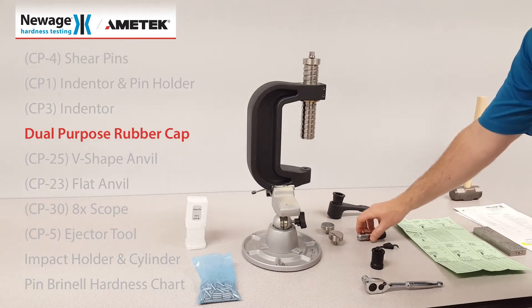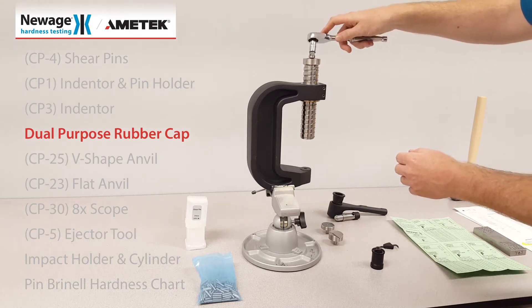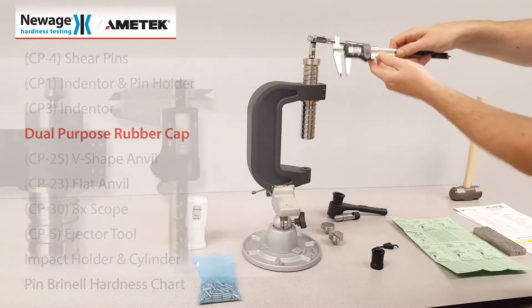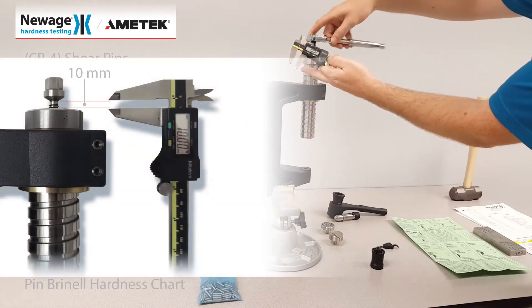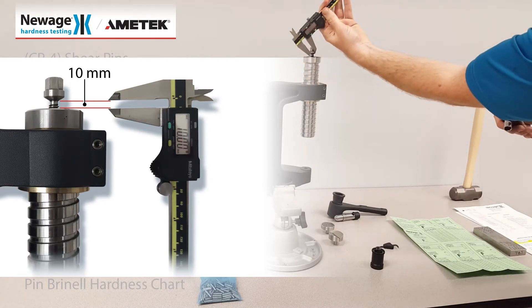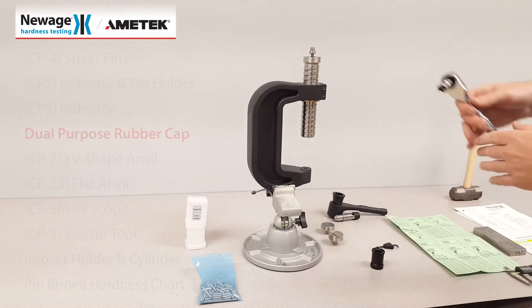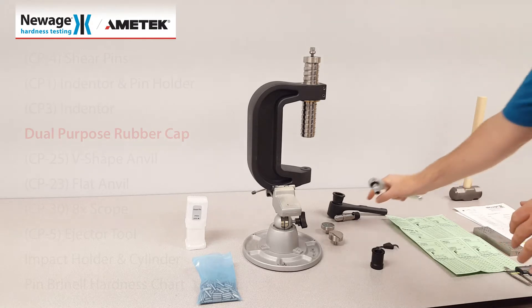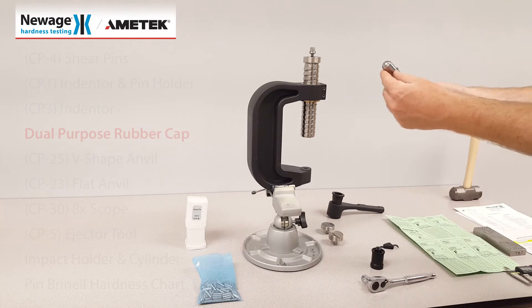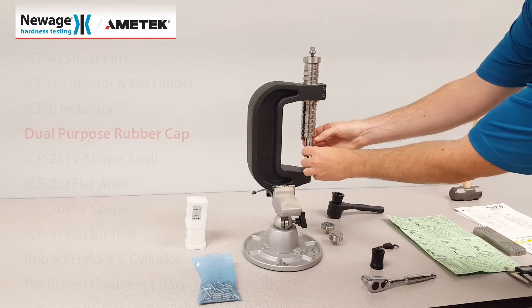Before you perform the test, back off the drive screw approximately one centimeter. This prevents damage to the tester clamp. Insert the indenter holder, indenter, and shear pin assembly into the larger screw.